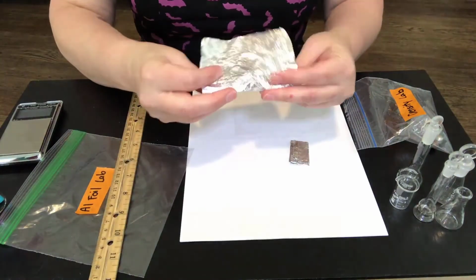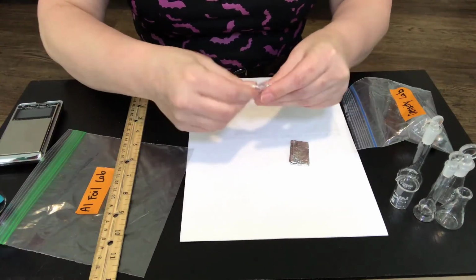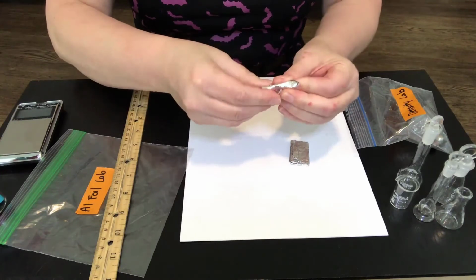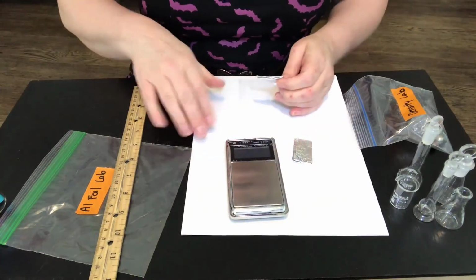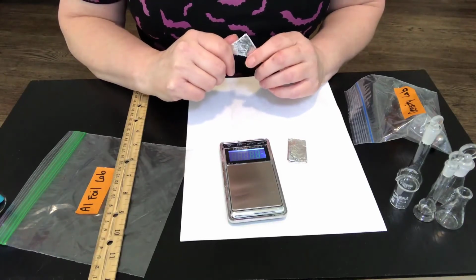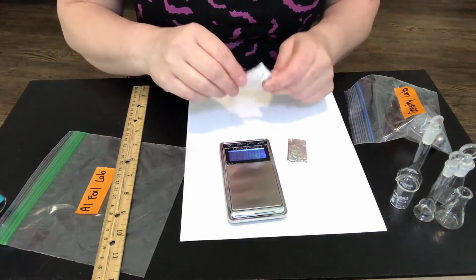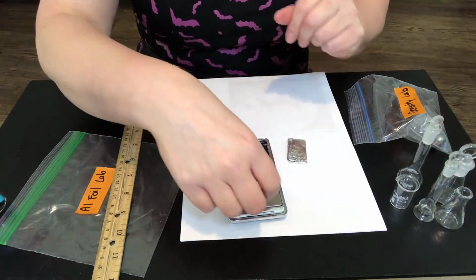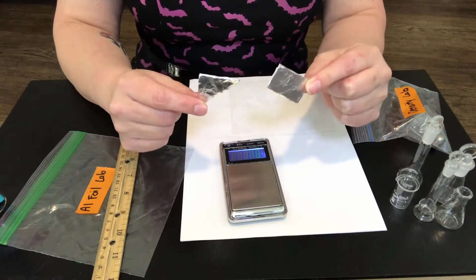And then one of the pieces of aluminum foil, we folded it up into the shape of a triangle. And then we took our balance, and when we use a balance, we always check the units. So this one says grams, that's good. I always tare just in case. And then we got the mass of our piece of aluminum foil. We did that for the triangle and we did that for the square.